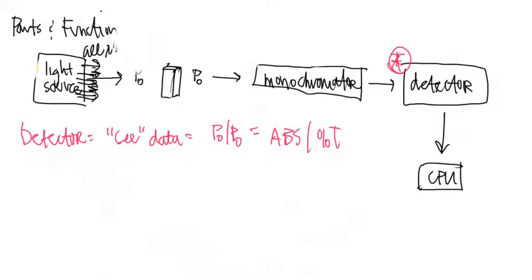All right. So the detector in this case is called a PMT. And the PMT is not CMT, country music television, but the P stands for photo, and the M stands for multiplier, and the T stands for tube. So photo multiplier tube, PMT. And the photo multiplier tube is basically the way that it takes a signal from the machine, amplifies it, and gives it to a software system like a computer.